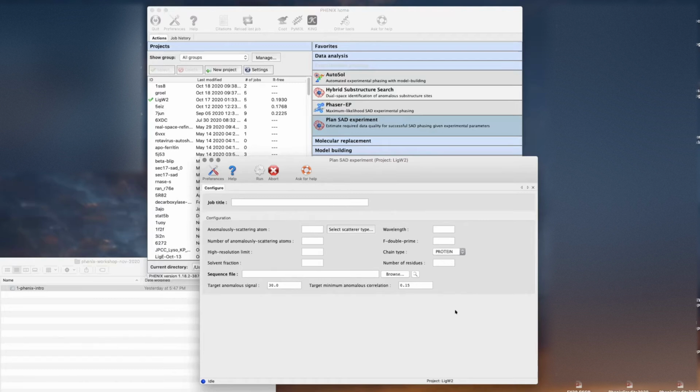So here's our question: 2.5 angstroms, 200 residues, 2 seleniums, collected at the peak. Will we solve this structure? Okay, so just a yes or no. Is this a slam dunk? So let's click on participants and give ourselves an answer. Everybody vote on that one real quick. Well, the yeses are winning. The yeses are winning. Okay, so let's do our simulation now.